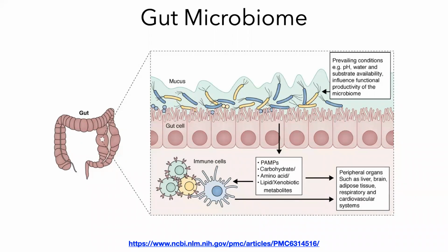So as you look through the data sets, make sure that you find data sets that have good data, the kind of data you want to use, that have good annotation for that data, and it's in the right format, so you can actually know what type of analysis to use for that data set. So let's take a look at some of these examples, okay?